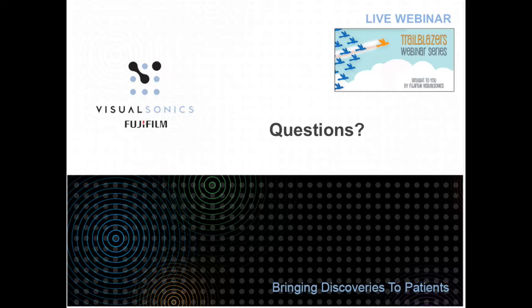Great. Well, thank you both to Drew and Dieter. Lots of different interesting applications that we've seen. Hopefully it's given everyone a sense of how the Vivo technology, the ultrasound and photoacoustics, can be used for a variety of different areas, including molecular imaging, which we really focused on towards the end. And in addition, its complementary aspects with other imaging modalities that many of you may already be using. So I would like to open things up for questions.